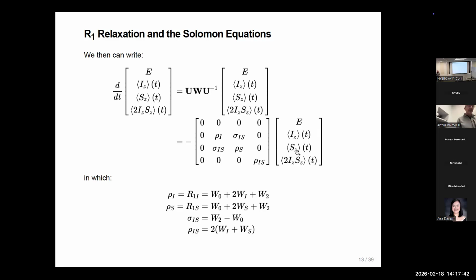That comes up from what's called relaxation interference that we'll eventually get to, but it requires that there's two Hamiltonians at work. And most common, that could be two dipole interactions. Perhaps our S spin has a dipole interaction with two different I spins.